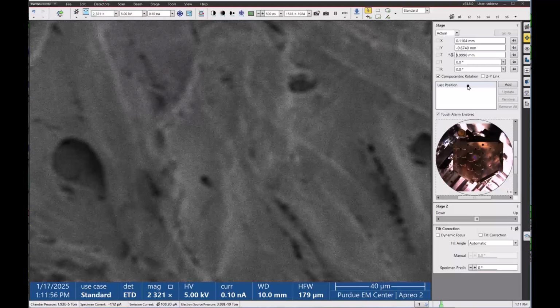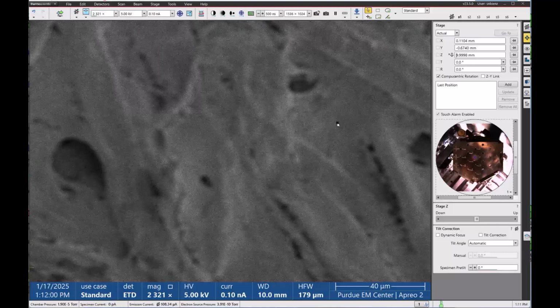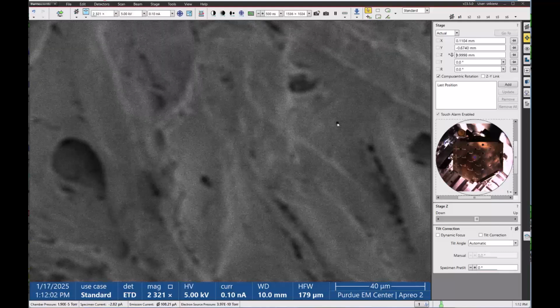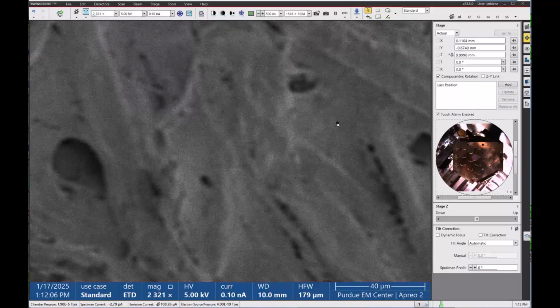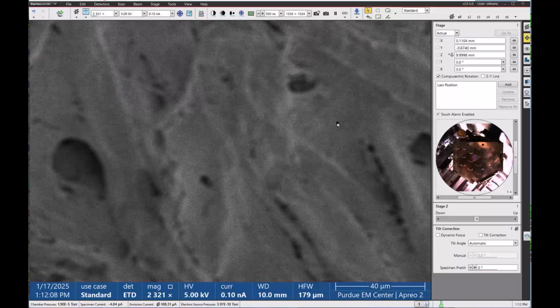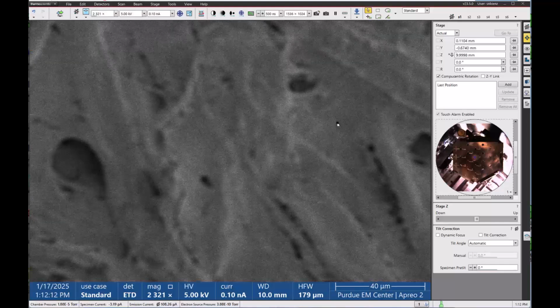You should use it. This portion of the demonstration is basically to show you linking can substitute for a CCD camera, for example, if it's broken, or if you happen to be working on a microscope that's old enough that a CCD camera simply isn't present in the microscope.